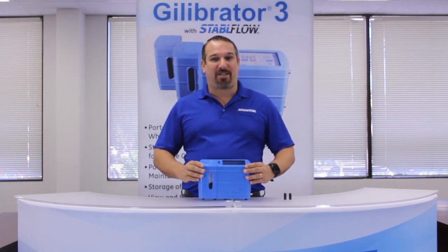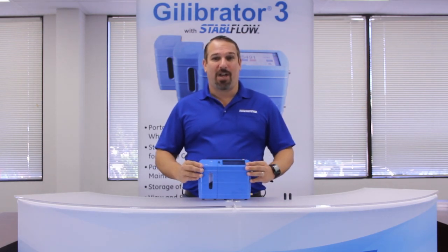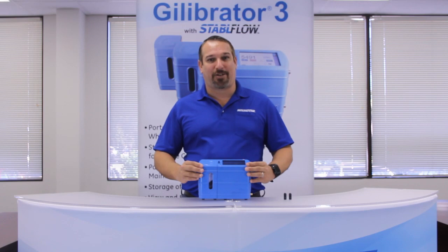The Gilibrator 3 comes with a base that is fully assembled and includes an internal battery. All that is needed is to attach your desired flow cell and use the tube sections and adapters to set up your sampling tray.